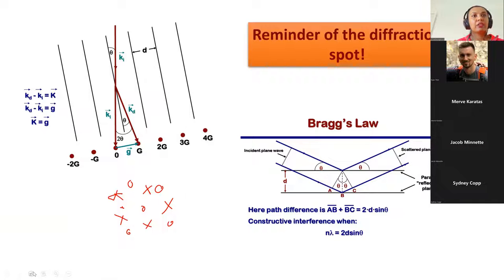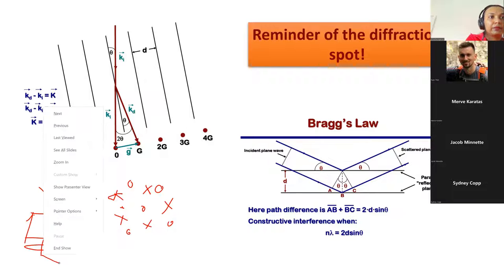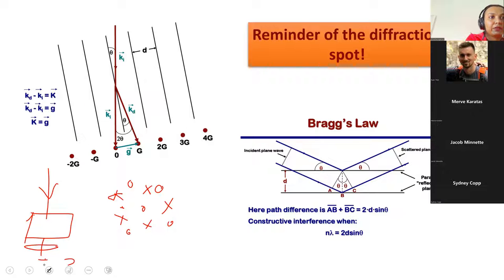Yeah. So both these diffraction patterns are coming from the same area. In reality, you have your transmitted beam, you have your sample, and it goes to an objective lens here, and you get something called a diffracted beam, D. And you have a transmitted beam, T here, right? And what you get is a pattern like this, simply. Now, in this case, you will also have a certain oxidation on the top, which is giving you a pattern, which I marked with the crosses, whereas there would be a pattern coming directly from the main sample, which is marked in the form of a circle.